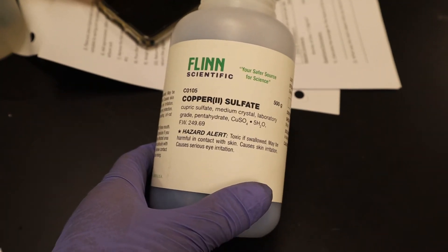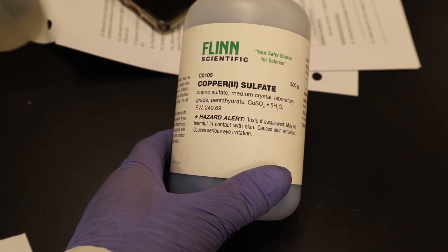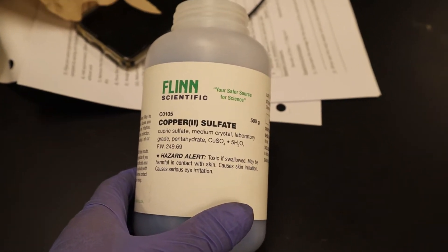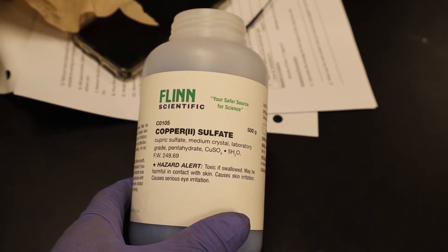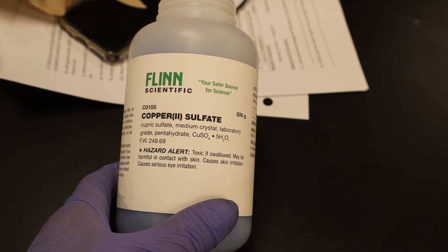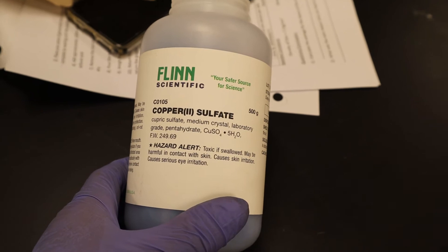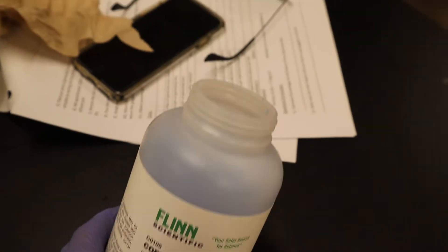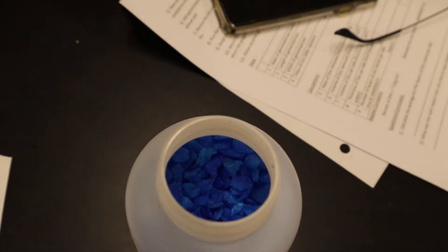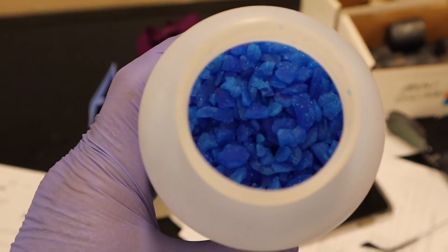This is the label of the copper sulfate hydrate. I always check the hazard alert. It says: toxic if swallowed, may be harmful in contact with skin, causes skin irritation, causes serious eye irritation. I would always check that before you use anything. But it also gives you the formula there. If you look inside, it's a bright, bright blue — blue crystals.